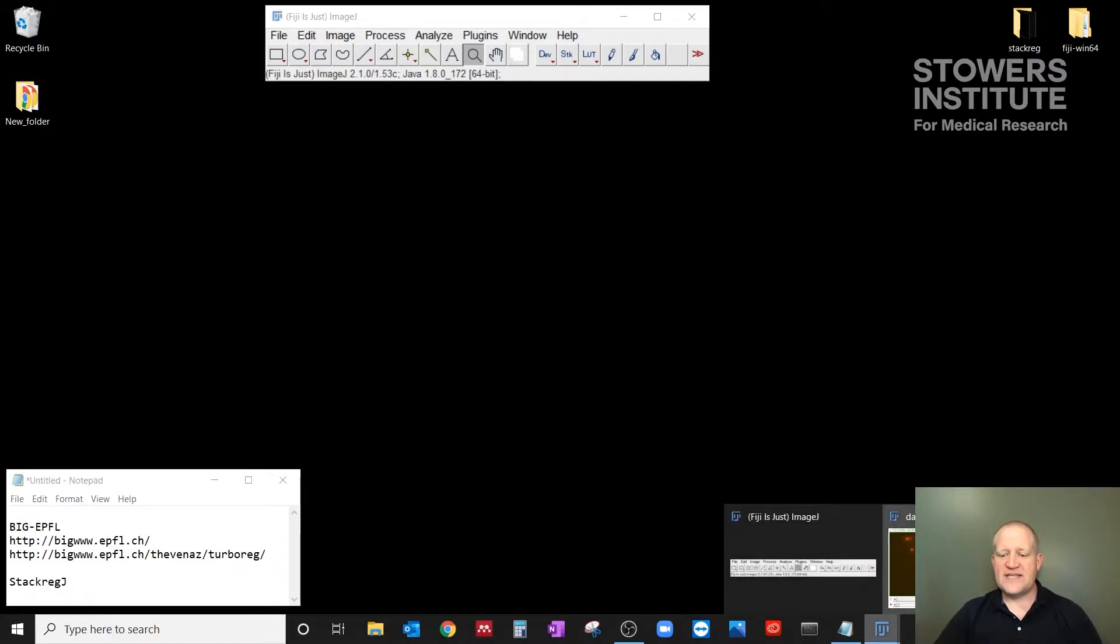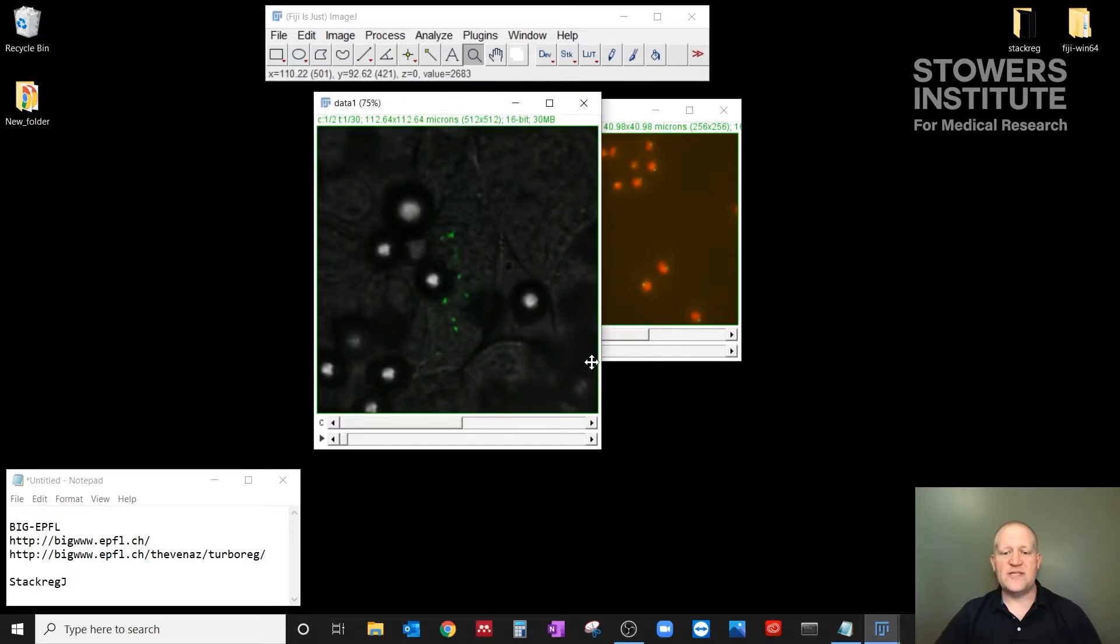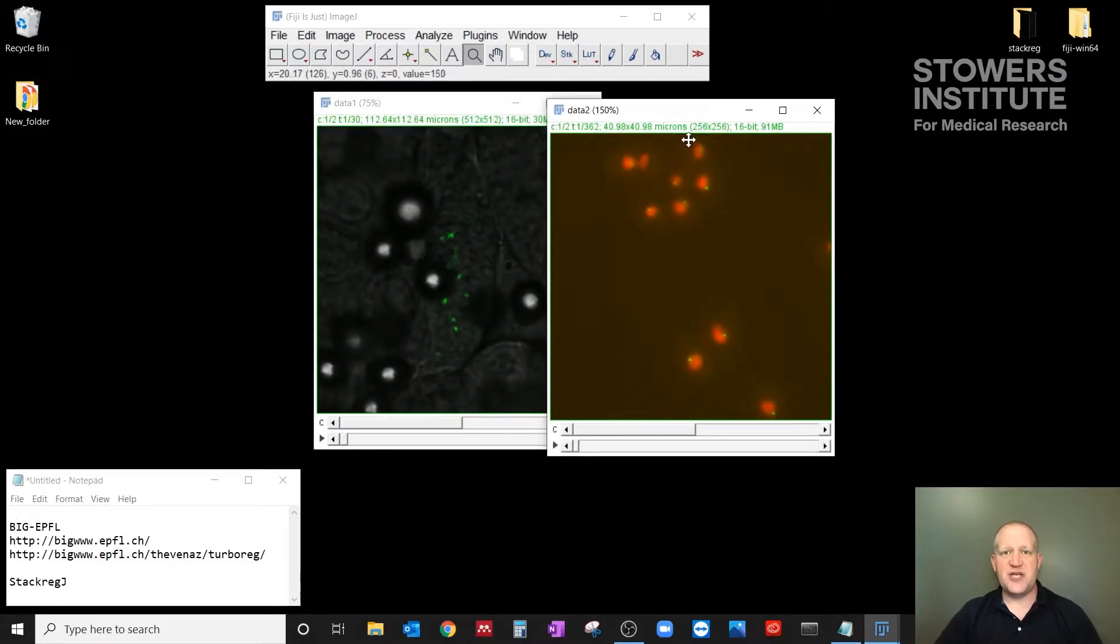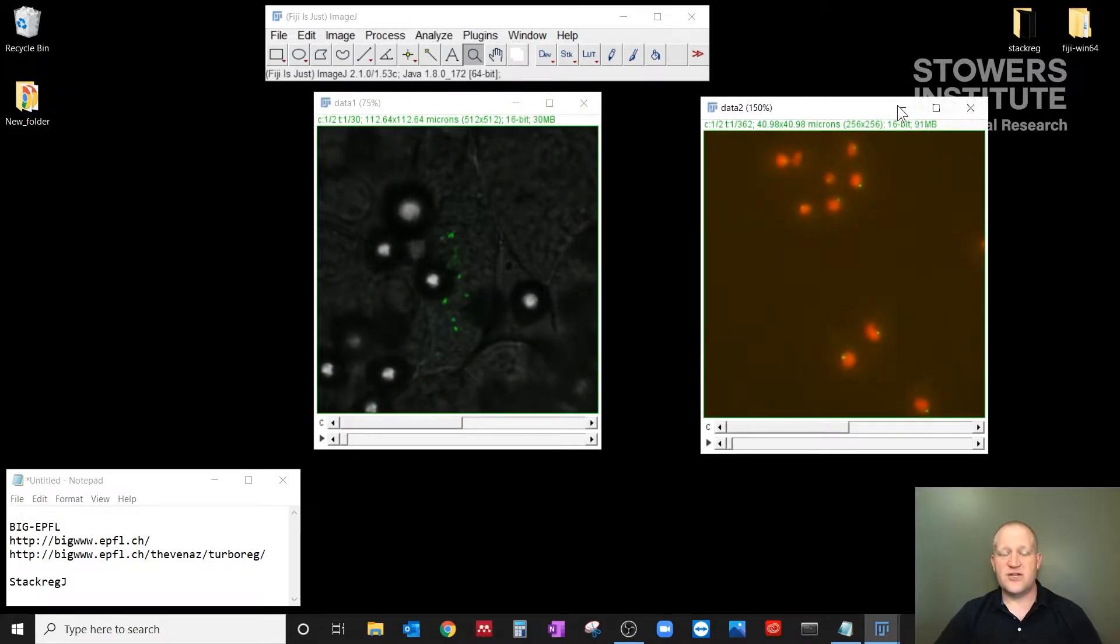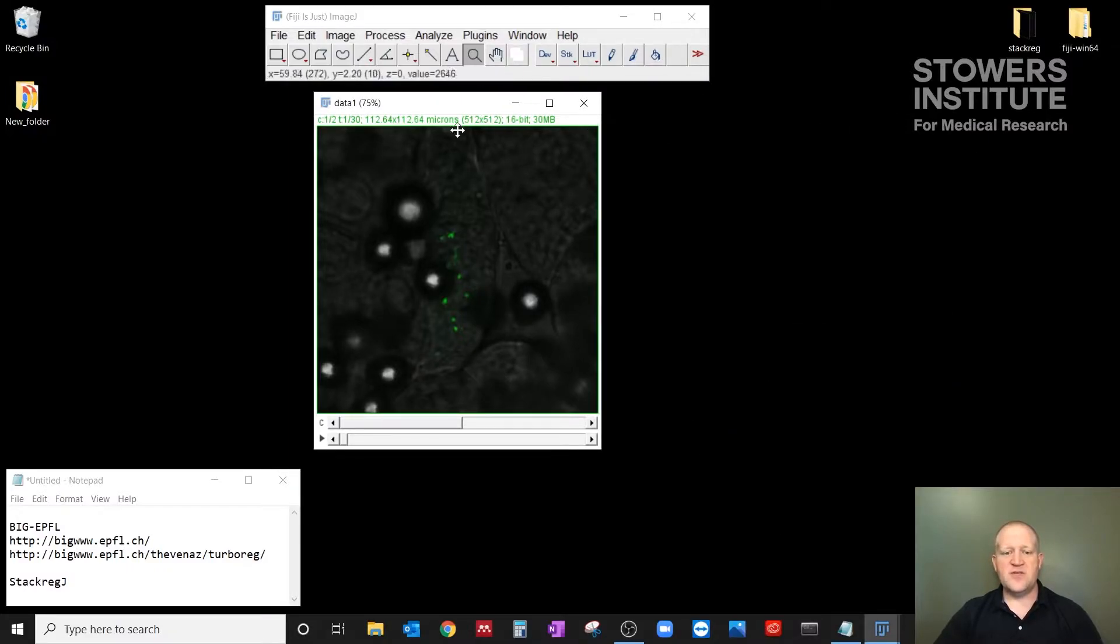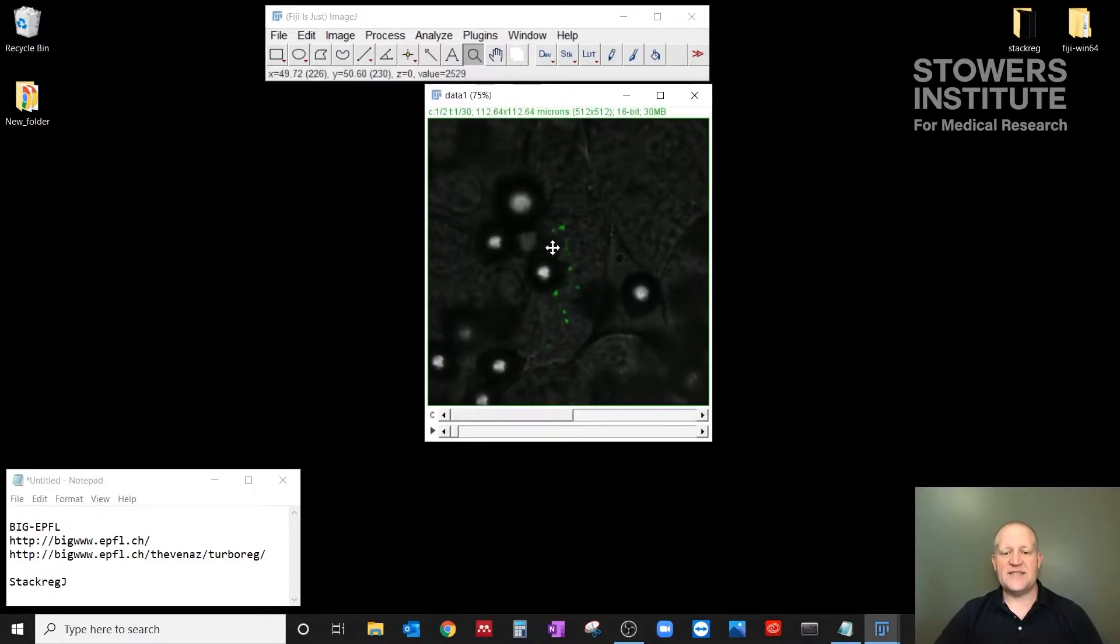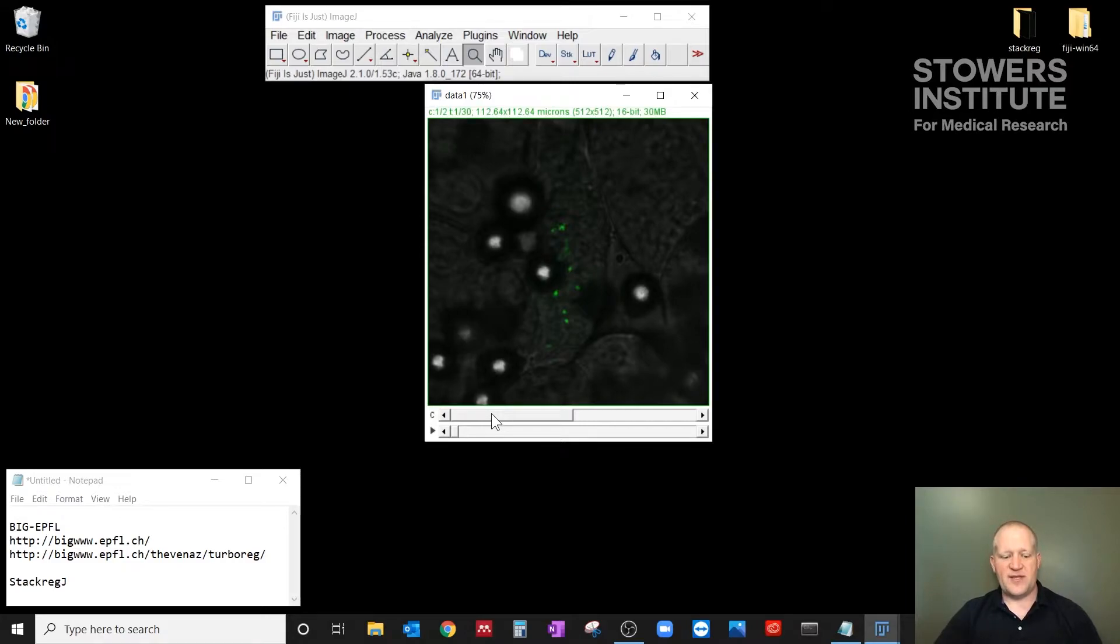So we have two different datasets that will show us multiple ways in which you can use StackRegJ to register the images in your movie. The first one we're going to use has a fluorescence channel and a transmitted light channel, and you can register on either of the channels. So when you run StackRegJ, make sure you've selected the channel that you actually want to register on.